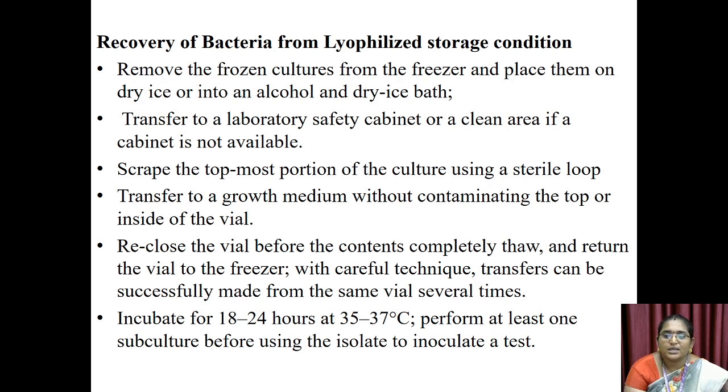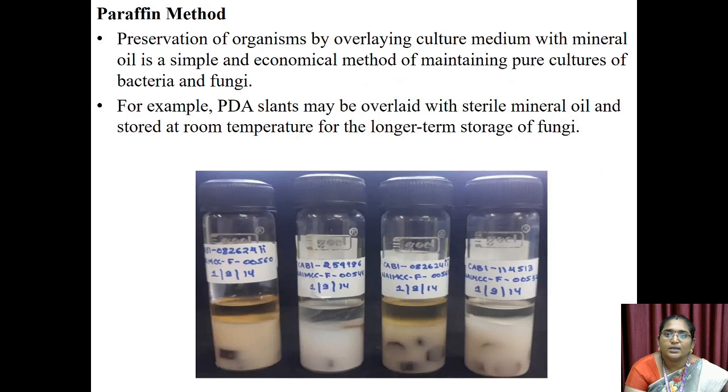With careful technique, transfers can be successfully made from the same vial several times. Incubate for 18 to 24 hours at 35 to 37 degrees Celsius. Perform at least one subculture before using the isolate to inoculate test. Next one is paraffin method.